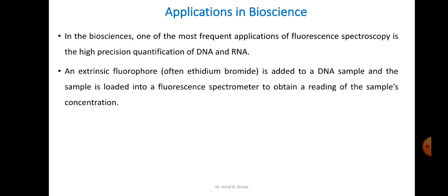Then we can extend this spectroscopic technique even to the bioscience. Bioscience is again a major field where we find applications of fluorescence spectroscopy, and one of the most frequently used applications of this technique is in the detection and quantification of DNA and RNA with high precision. You know the precision is the repeatability of the result, right? So with high precision we can quantify the DNA and RNA present in the biological sample.